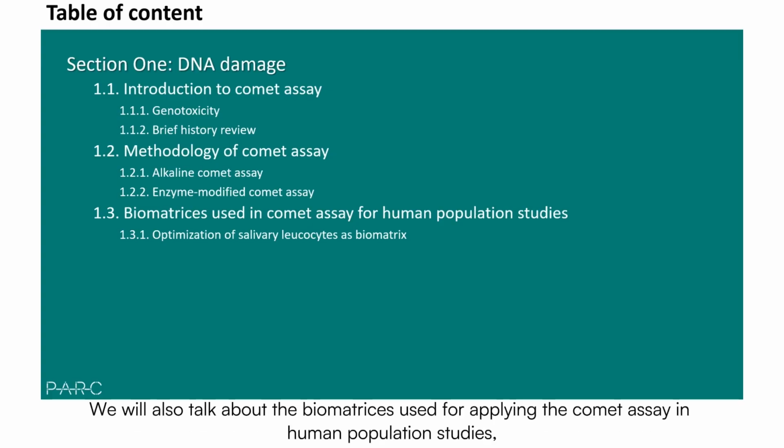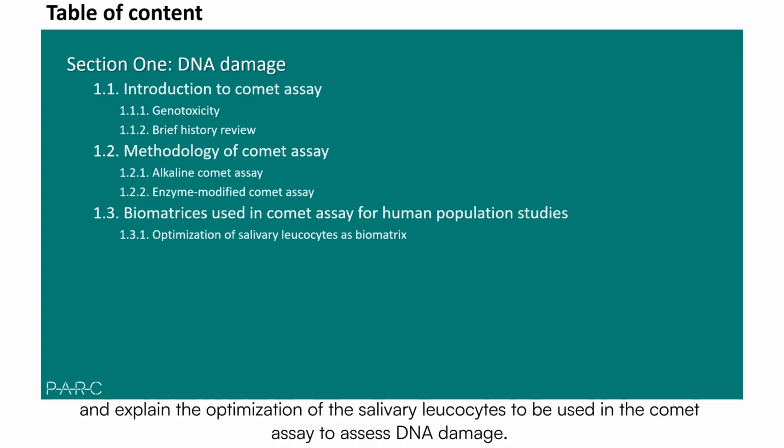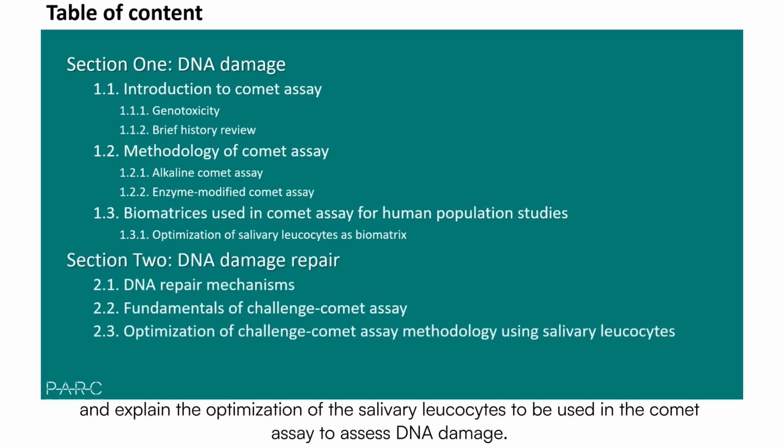We will also talk about the biomatrices used for applying the COMET assay in human population studies, and explain the optimization of the salivary leucocytes to be used in the COMET assay to assess DNA damage.